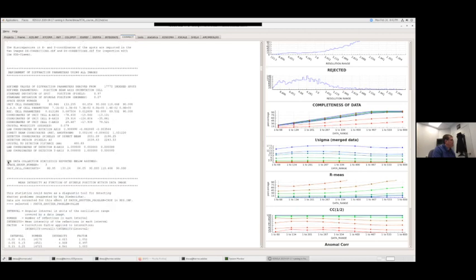Okay, so it tells us it's selected that space group and that these are the unit cell parameters. And so if I'm going to reprocess this or a similar crystal where I know the space group is the same, I could actually use those values as an initial starting point back in my input file.